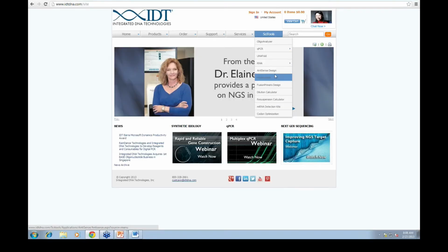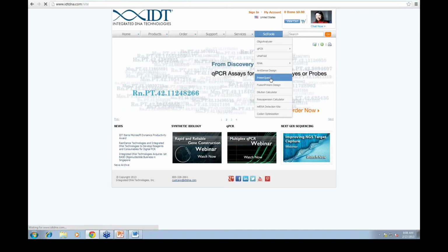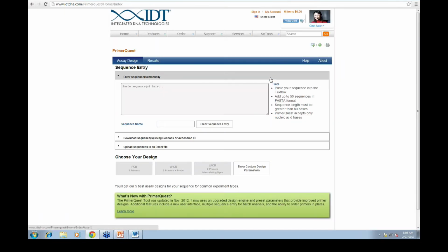So switching back to our live site, I'm just going to go ahead and select PrimerQuest from the Sci Tools drop-down. There are a couple ways to get to the PrimerQuest Home tool. I think that way is the easiest. So once we get to this page, the first thing that we would need to do to start a design is enter the sequence or transcript that we want to design against.